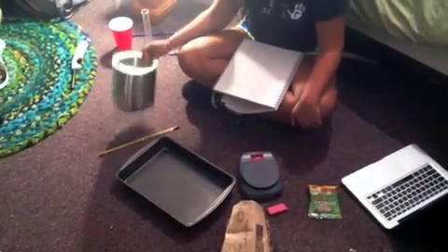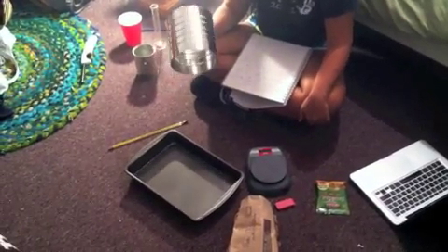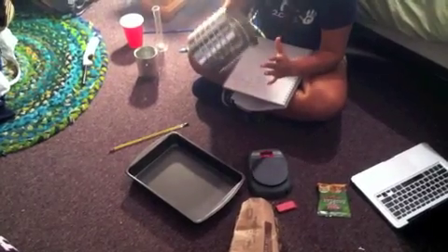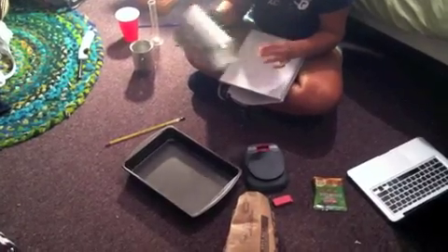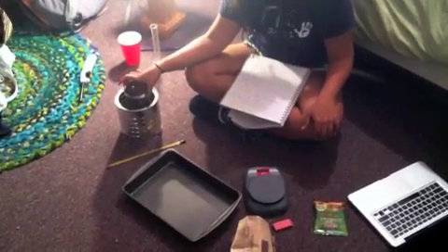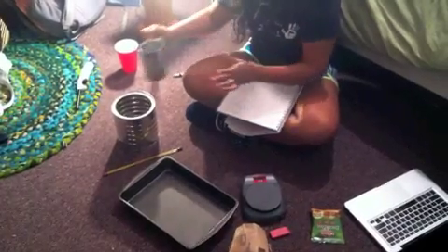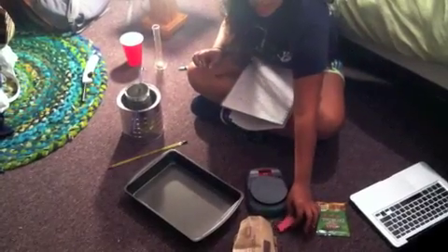Today we're preparing a lesson on calorimetry and we're building a homemade calorimeter using a coffee can. We removed one of the tops and the bottom so that we can see all the way through it. We have a smaller can that will fit inside of it, and it has two holes for a rod to go through so the inner can will be suspended over the heat source.